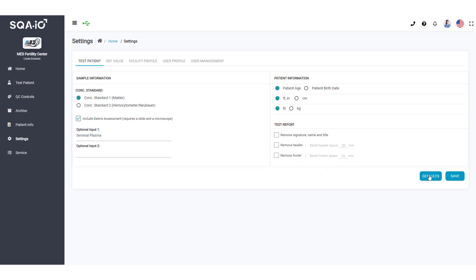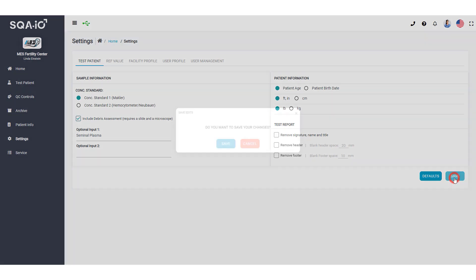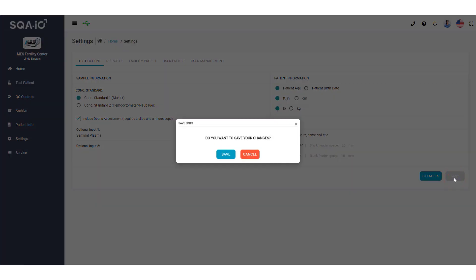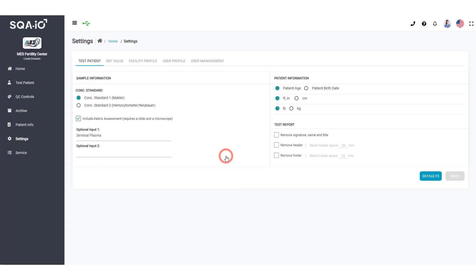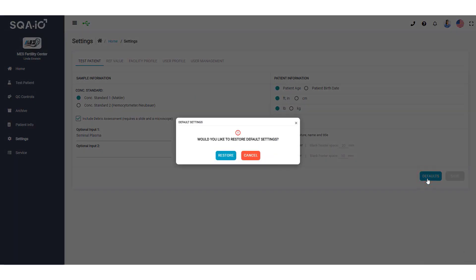Click Save to apply the settings defaults. Click Defaults to return the settings back to their original configuration.